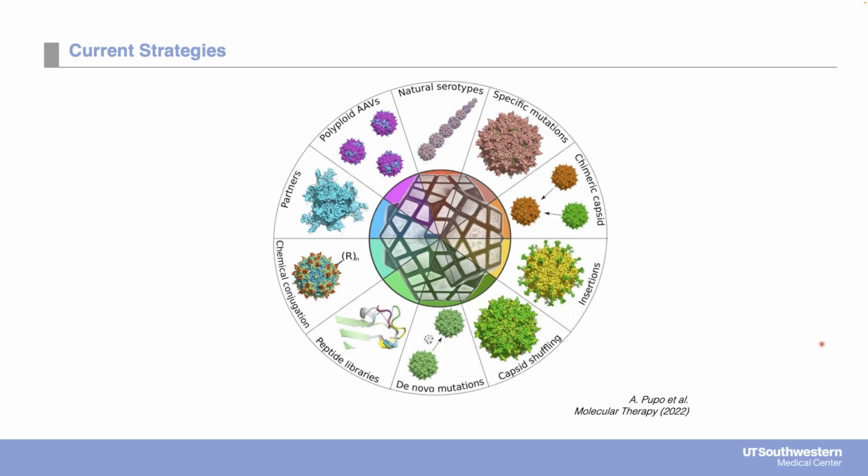But before we dive into it, I really just want to take a moment to appreciate all of the clever different ways that people have gone about engineering AAVs, such as peptide insertions that have shown promising outcomes for research, such as PHP.V, as I stated earlier. And I know there are some companies that are now starting to see some effective capsids through this methodology.